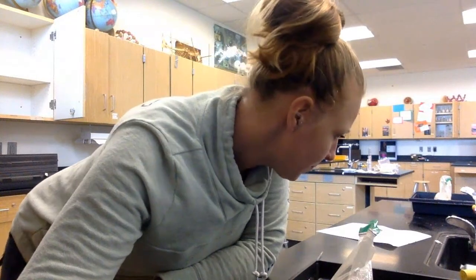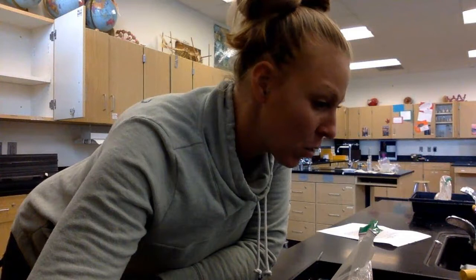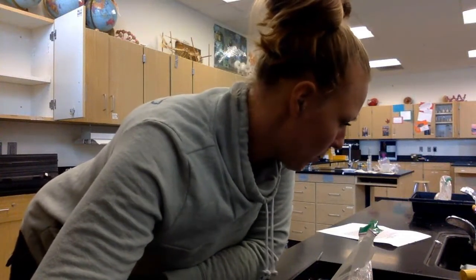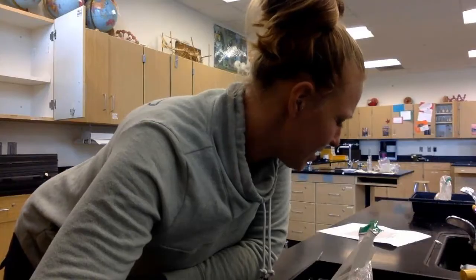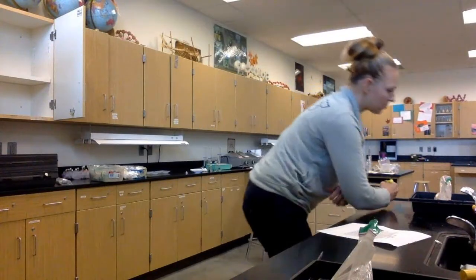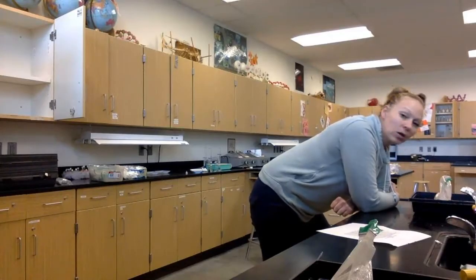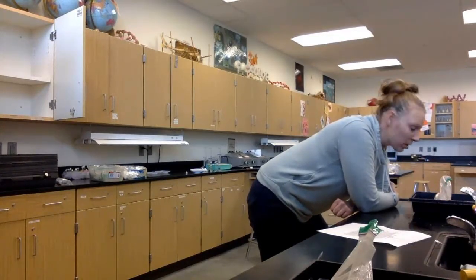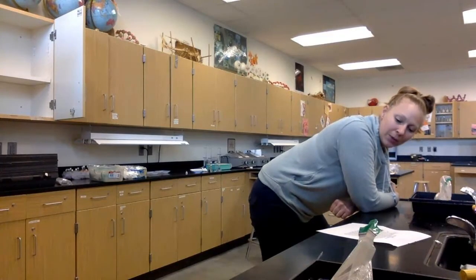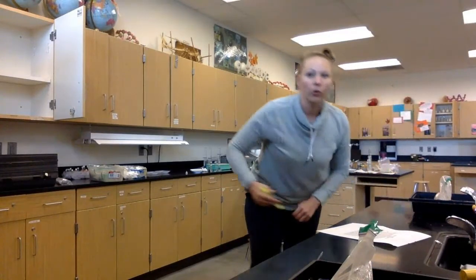At the five-minute mark: respirometer one is at 0.84, starting to draw down. Respirometer two is 0.89. Respirometer three is 0.91. Respirometer four is 0.88. Respirometer five is 0.90. Respirometer six is 0.94.